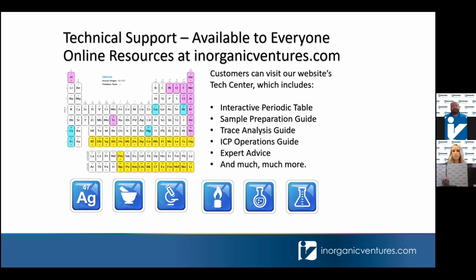I've worked with it for a long, long time. I've always wanted to buy more of the technical grade of material, because what I would check for would be trace metallic impurities. You don't get any cleaner or dirtier with the grade of TEA if you use a technical grade.